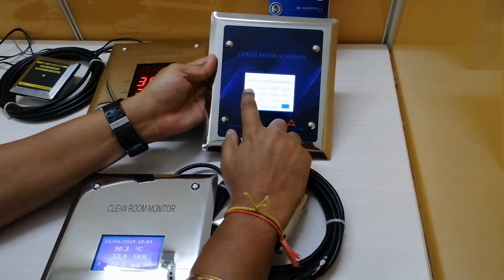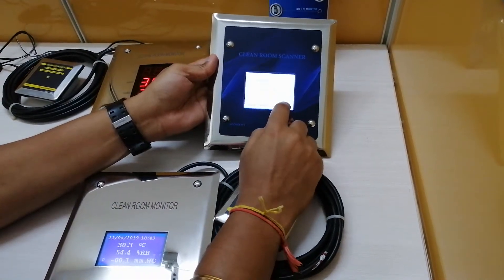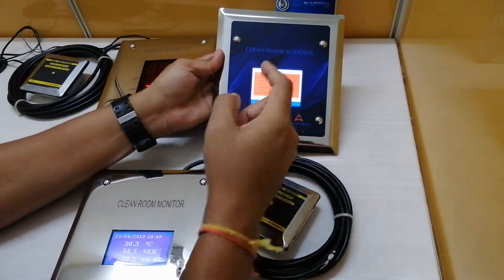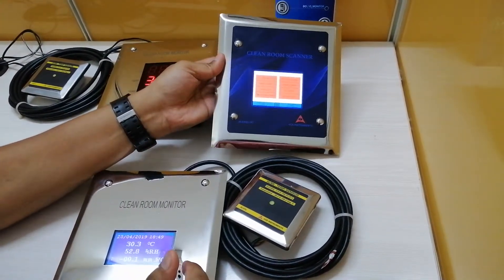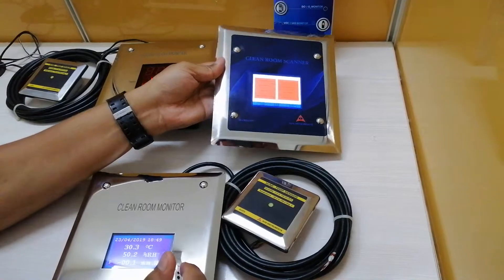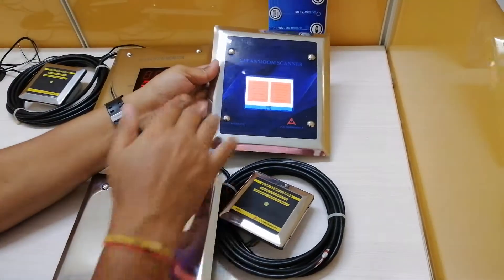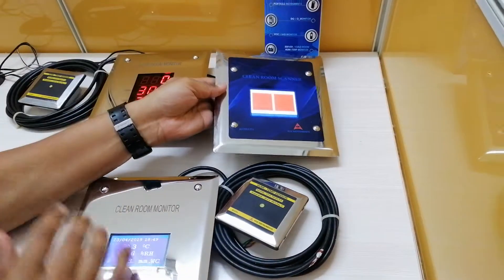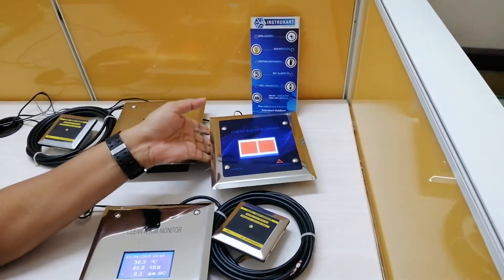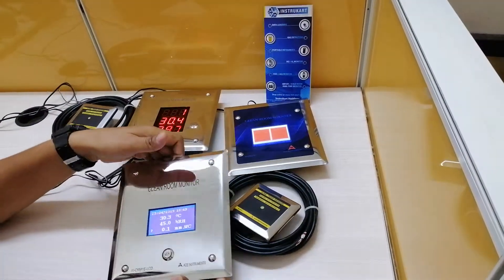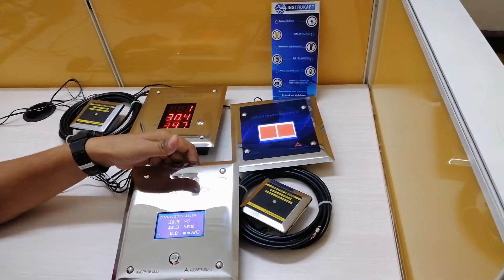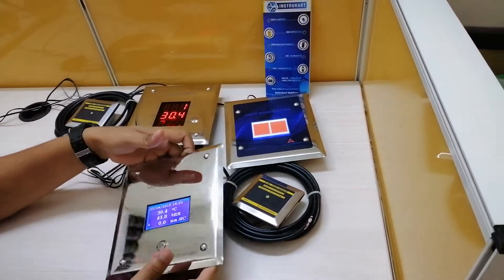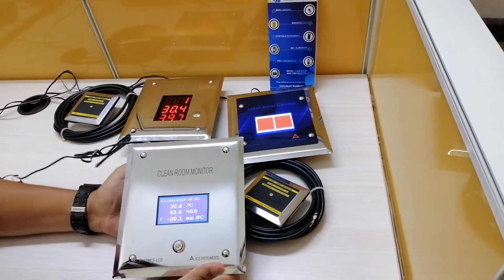You can get into the menu option and do the settings over here. We have a separate video for these instruments, but I just wanted to have an overview for all these monitors together, how it looks and the look and feel of this particular monitor.